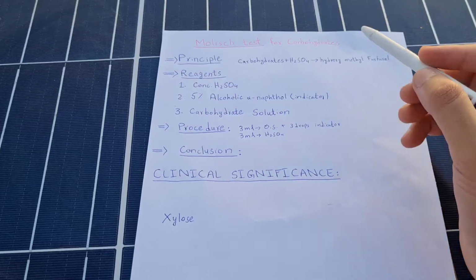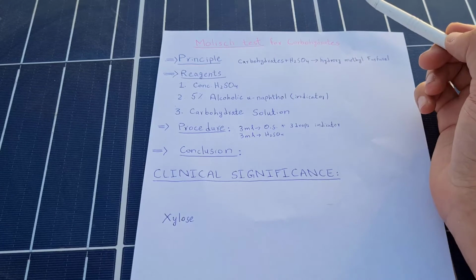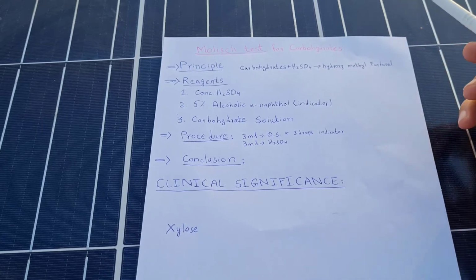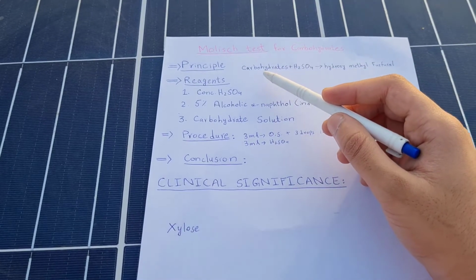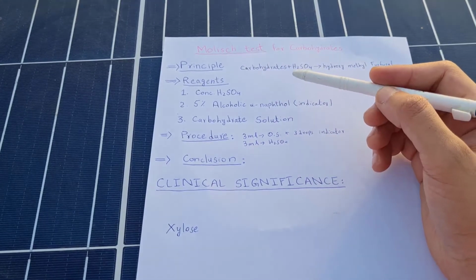Hey friends, let's talk about Molisch's test, which is famous for the detection of carbohydrates in a given solution. First of all, let's talk about its principle. Molisch's test takes advantage of the dehydration properties of carbohydrates.